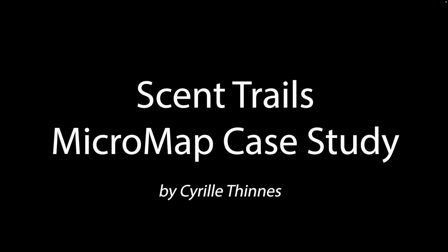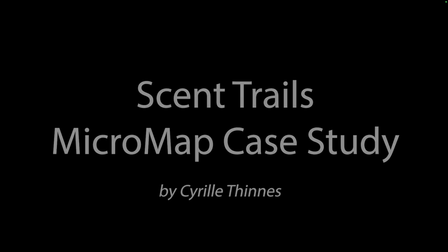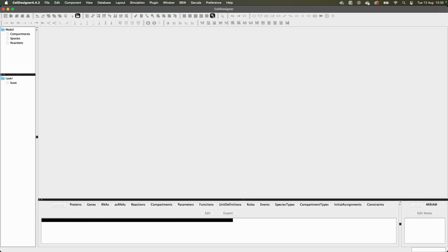Most of the gas we release is actually odorless: hydrogen, carbon dioxide, methane. It's the trace gases, less than 1% of the volume, that give farts their scent. And among those, hydrogen sulfide is the smelliest. H2S is produced by the gut microbiome, and it's been linked to both health and disease. In this tutorial, we'll use the MicroMap to investigate H2S metabolism.